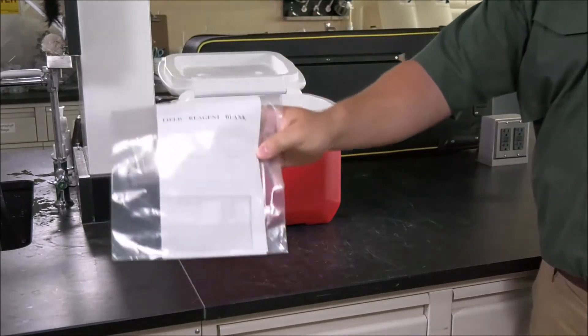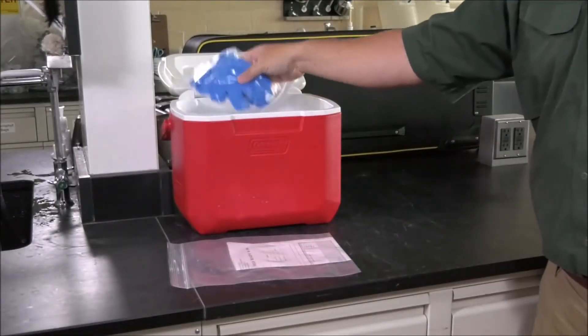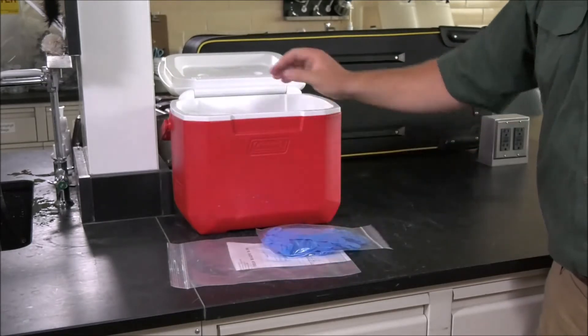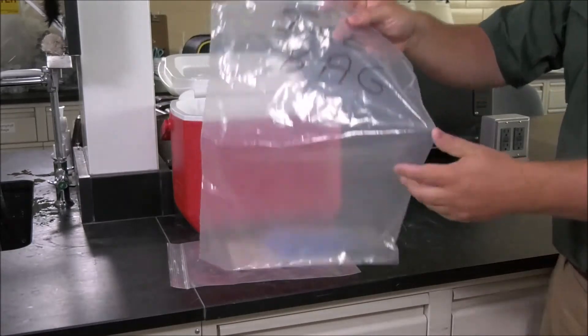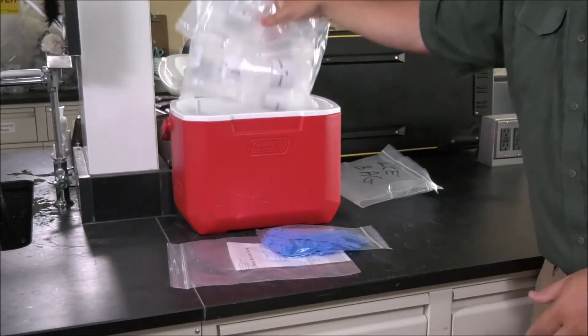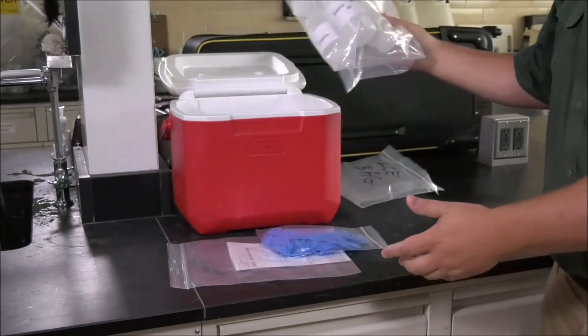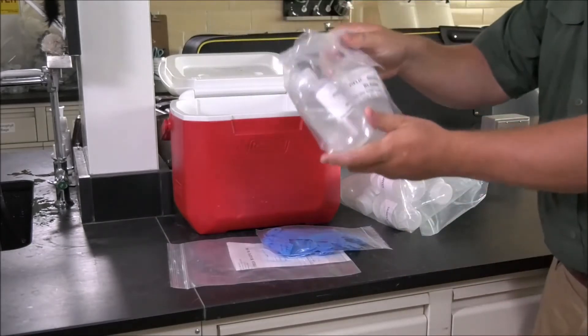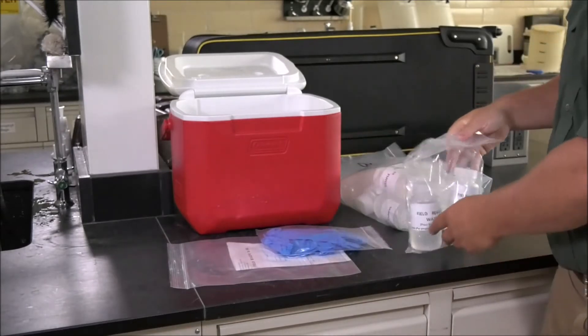The chain of custody form, a bag containing nitrile gloves, an empty resealable plastic bag, one resealable plastic bag containing six empty sample bottles with preservative, and a resealable plastic bag containing a field blank bottle with PFAS free water and an empty field blank bottle with preservative.